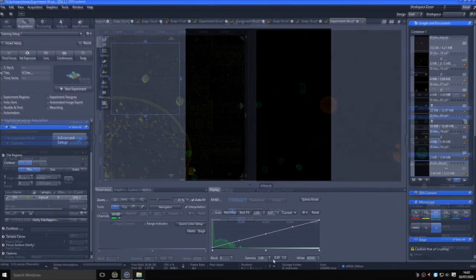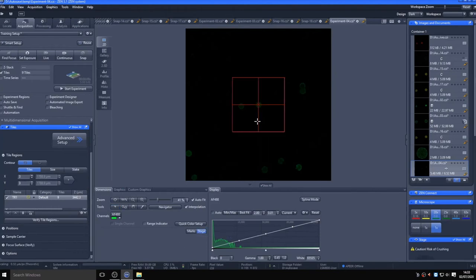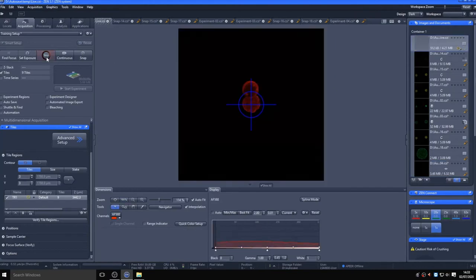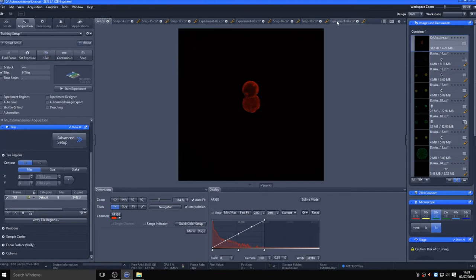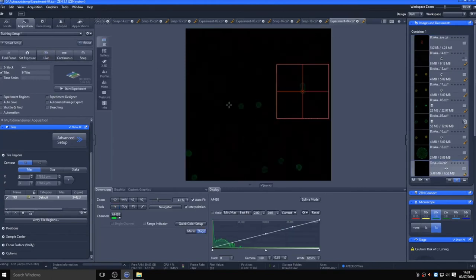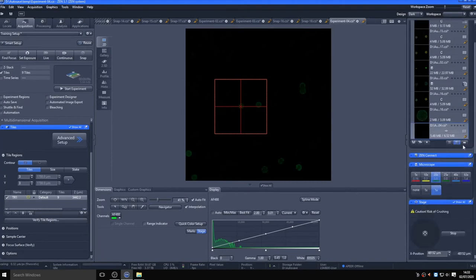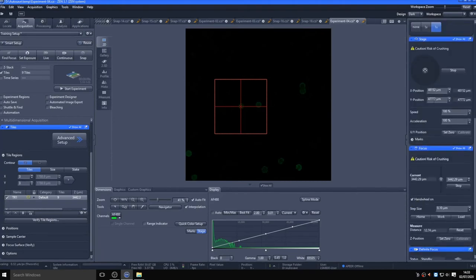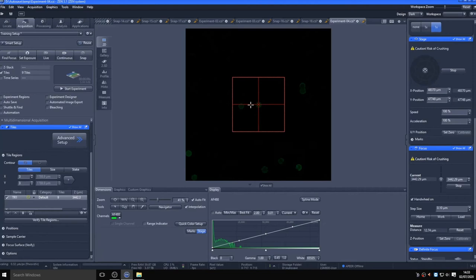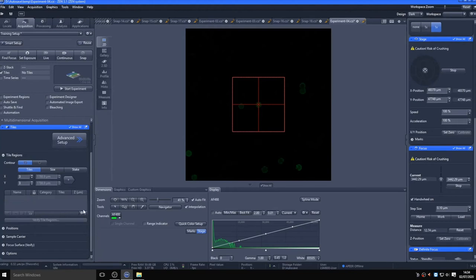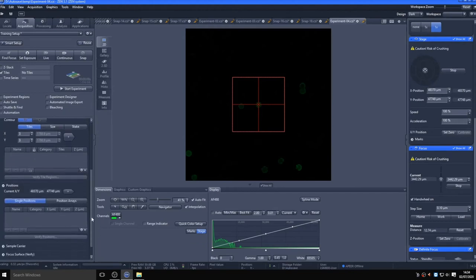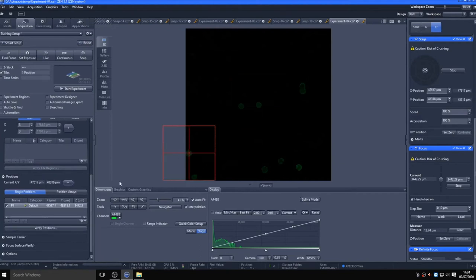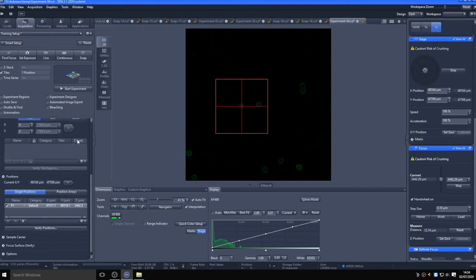Clicking on the stage tool will bring up a field-of-view box, and you can double-click on the image to move to that point on the image, so re-centering the stage onto that position. If you want to take an image at multiple positions within this tiled region centered on certain objects, then click on the Add Position buttons in the tiles-positions tab. So now when you start the experiment, it will move to the registered x, y, and z positions.